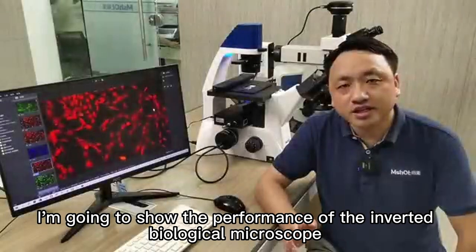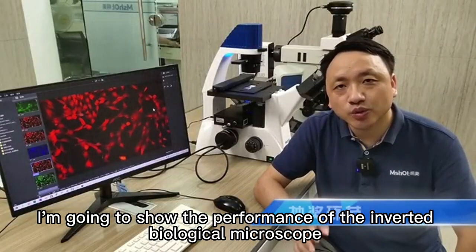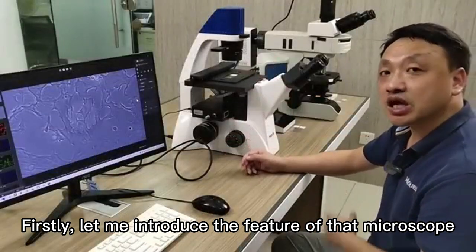I'm going to show the performance of the inverted biological microscope. Firstly, let me introduce the features of this microscope.